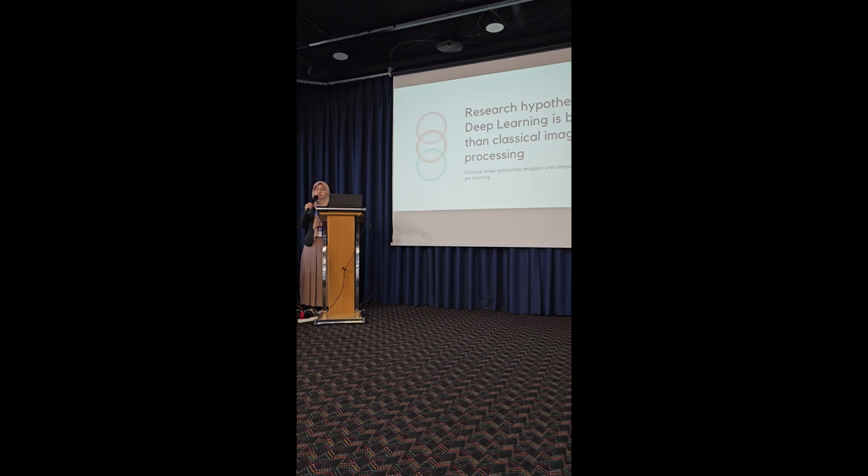And this is my research hypothesis. Deep learning is better than classical image processing, because I found that classical image processing struggles with detecting bacteria that are touching or overlapping.